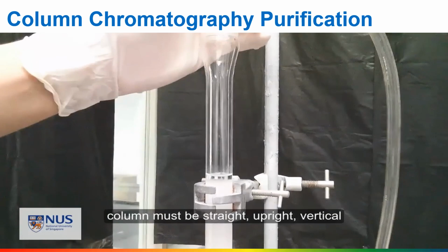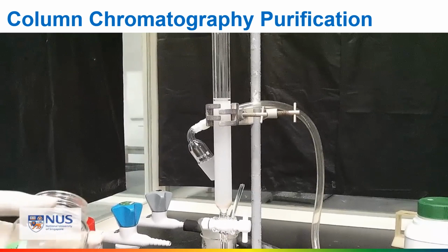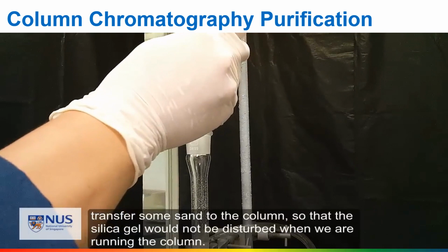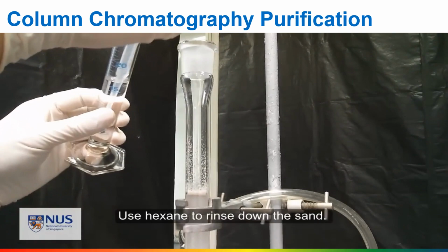After you have ensured that the silica column is packed uniformly in a compact mode and there are no air bubbles present, transfer some sand to the column so that the silica gel would not be disturbed when we are running the column. Use hexane to rinse down the sand.